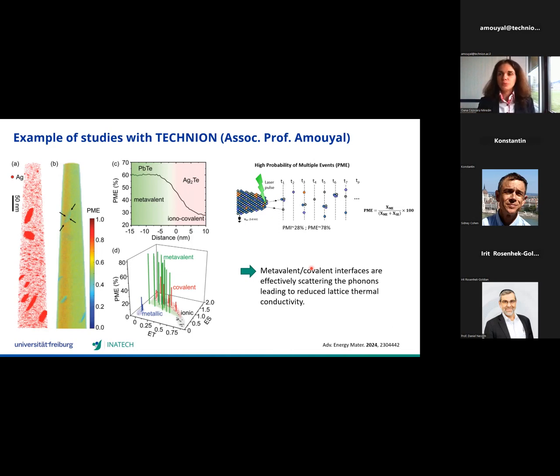And with the atom probe tomography, within the last years when I was still at RWTH University, together with Professor Wuttig, we have seen that there are materials which have a very peculiar bonding mechanism, and we have called that metavalent bonding. And if you look in the literature, there are many papers which have risen up in the last years about this new bonding mechanism.